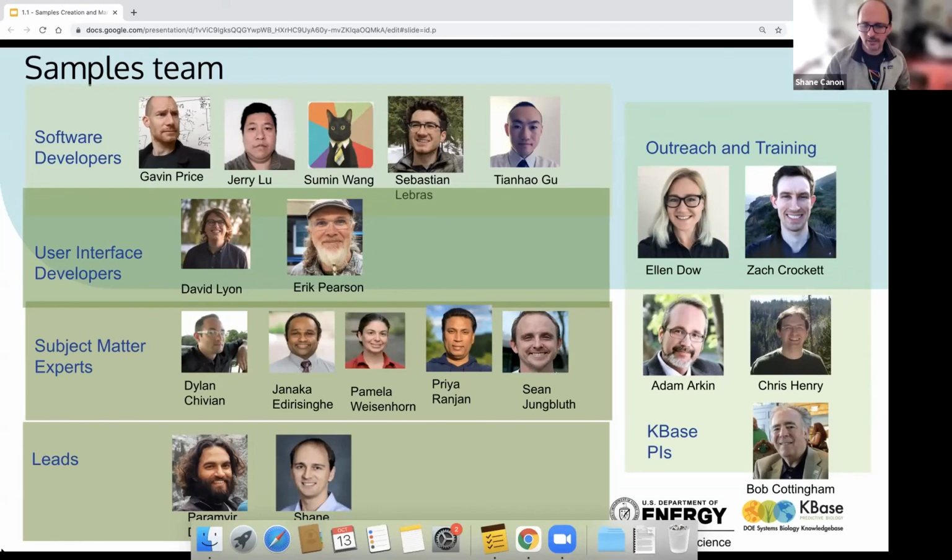Yeah, there are a lot of different packages, and their vocabulary is quite large, and we want to eventually pull all of those in, but it'll take us a little time. So if people have particular ones that they think are important to get in sooner, we'd like that feedback for sure. That's something that we are working on actively, bringing NCBI samples data. It's a great time to connect.